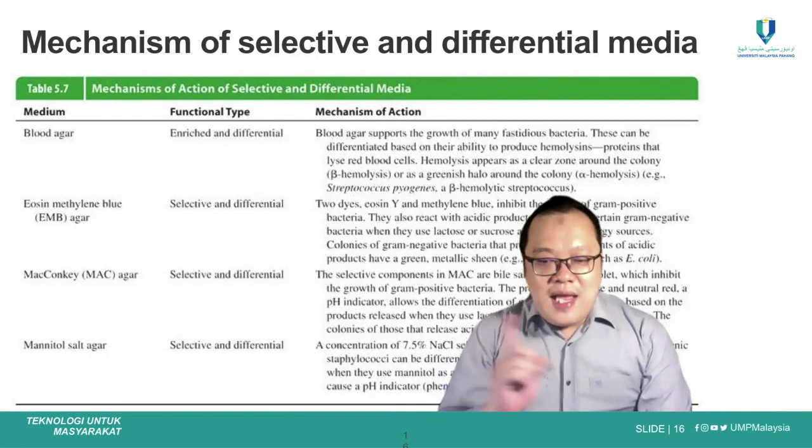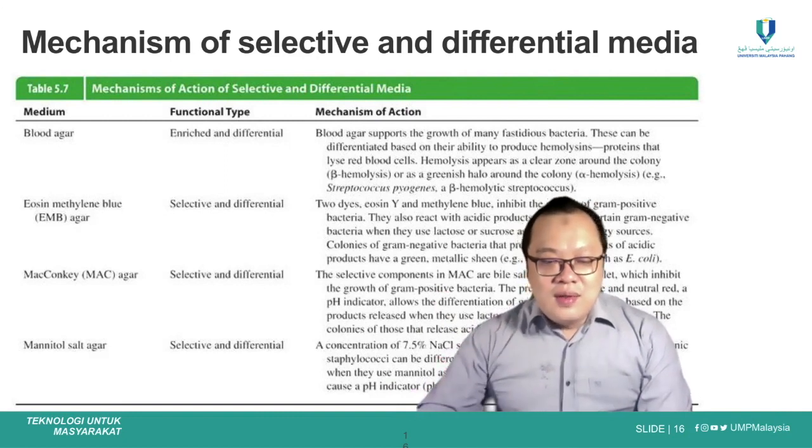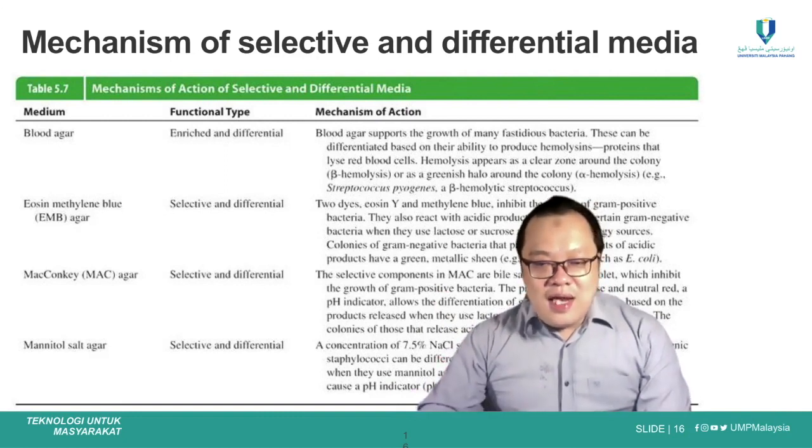Salt is also added onto the mannitol salt agar to inhibit those bacteria that are unable to grow on high osmotic pressure, such as 7.5% sodium chloride.